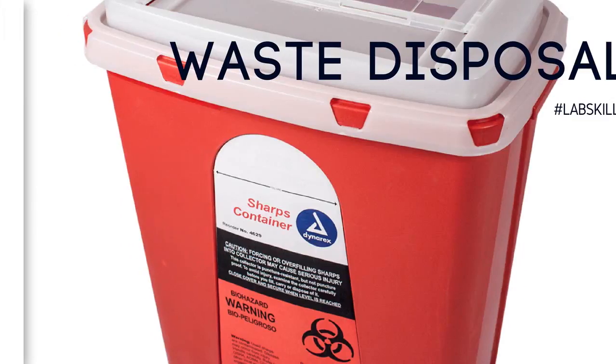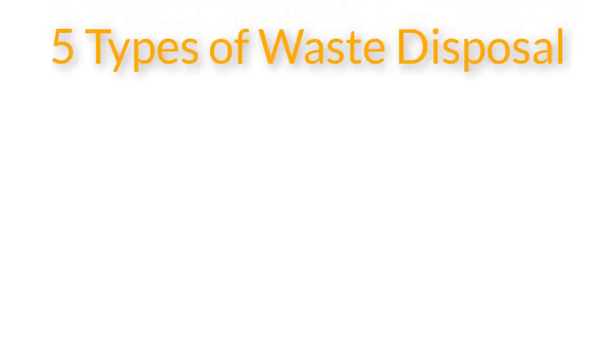Today I'd like to talk to you about proper waste disposal in the microbiology lab. There are five separate types of waste disposal containers in the micro lab.